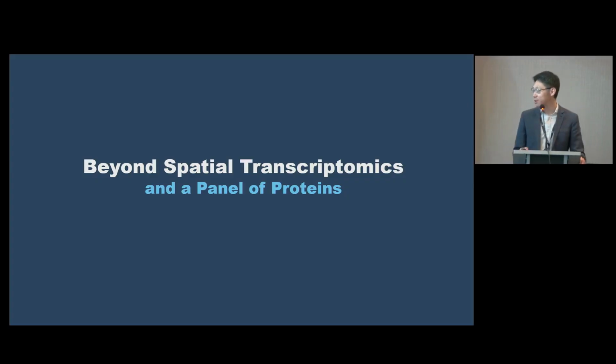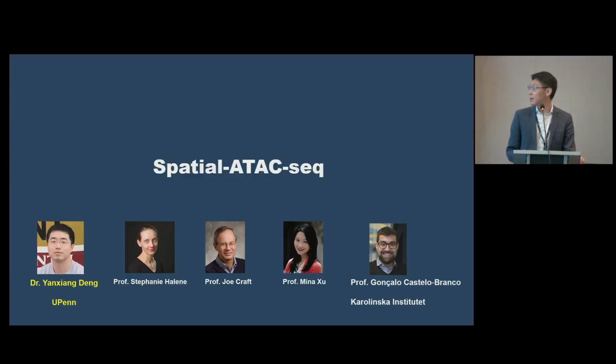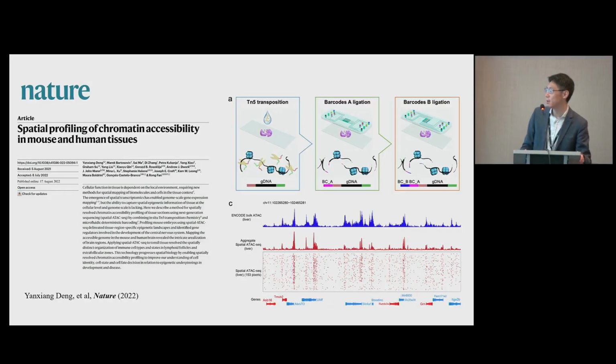And in my laboratory, we started to think about the underlying mechanisms driving or determining gene expression, and epigenetic regulation. There are many different epigenetic regulation mechanisms out there. We were interested in DNA methylation very early on, but we decided to work on these two first: global accessibility of chromatin and also specific histone modifications. The global chromatin accessibility analysis uses very elegant chemistry developed by Will Greenleaf and Howard Chang, and also Jason here, the first author of the paper reporting the chemistry called ATAC-seq.